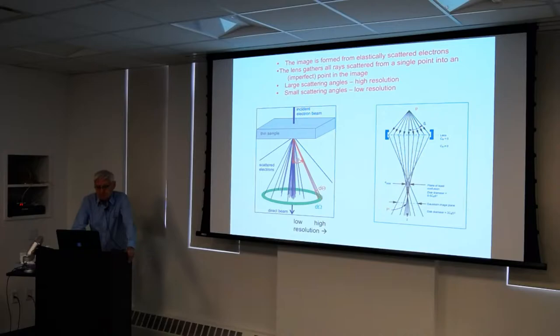So essentially, in an electron microscope, we have magnetic lenses, and the sample has to be very thin, because otherwise we get a lot of inelastic scattering. So the typical sample thickness is 0.25 microns. It shouldn't be above that. Typically, when we talk about single particle techniques, we're talking about 1,000 angstroms, or 0.1 micron. In general, large scattering angles are associated with high resolution, small scattering angles with low resolution. Now, the inelastic scattering is always low resolution. It's sort of confined in a very small pencil.